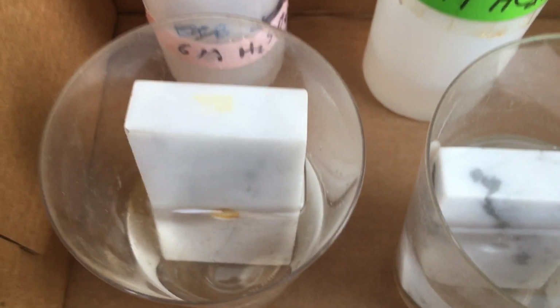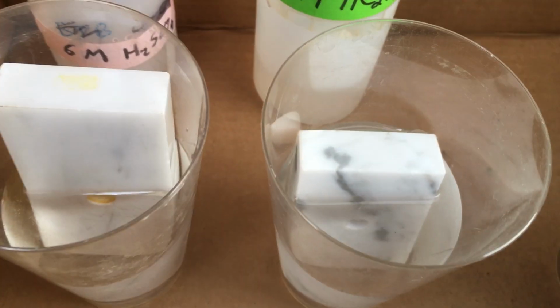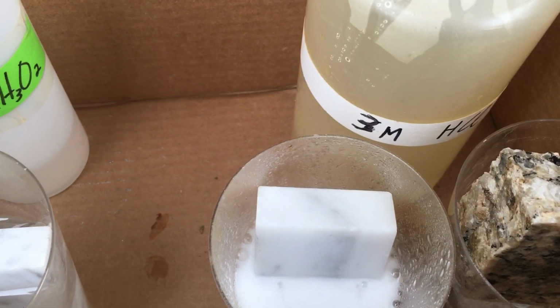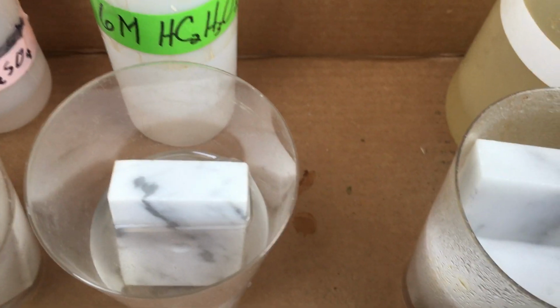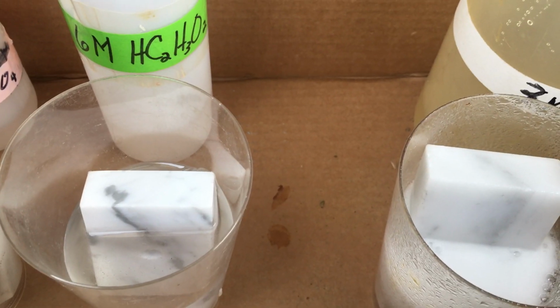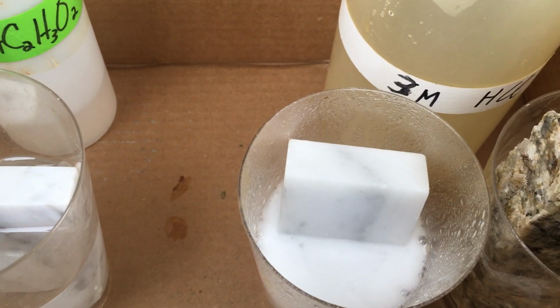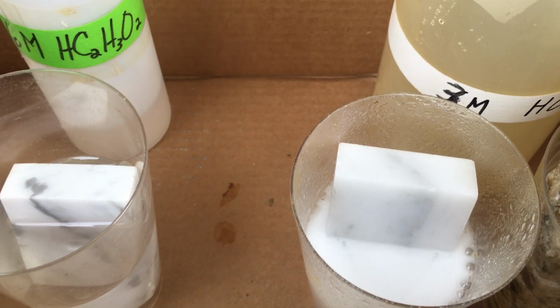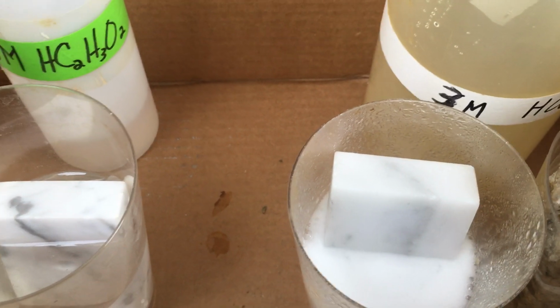Taking a look at the acetic acid, you might be able to see a little bit of bubbling taking place. Now, the concentration of the acetic acid is twice that of the hydrochloric acid. Why is it bubbling more slowly? Well, that's because the acetic acid is a weak acid, and doesn't dissociate into ions nearly as readily as the hydrochloric acid, which dissociates completely into ions. And so there are a lot more free hydrogen ions in the hydrochloric acid solution to interact with the calcium carbonate of the marble.